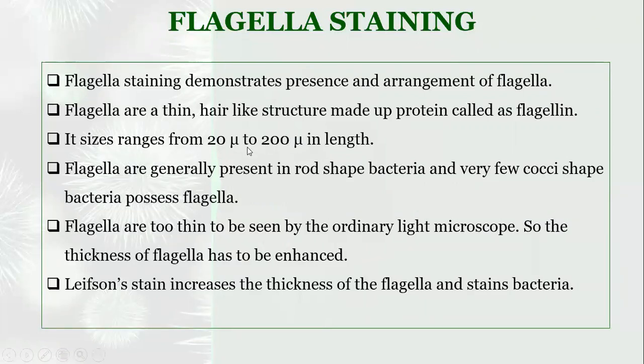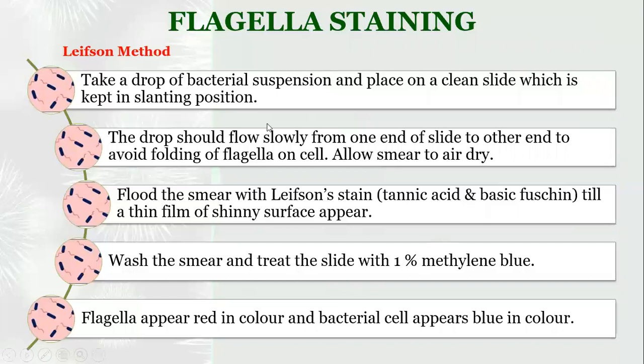The flagella are generally present in rod-shaped bacteria, but in a few cocci the flagella are present. Here, the Leifson stain is used to enhance the thickness of the flagella. The Leifson stain includes tannic acid and basic fuchsin, which enhance the thickness of the flagella. So this is the procedure for flagella staining. The method used is the Leifson method.